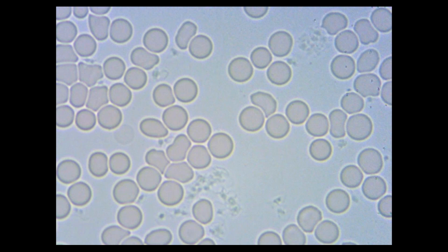And then also most of your white blood cell anomalies are only visible in dark field. Now, these would include assessing the lobes within the neutrophils and other white blood cells, assessing white blood cell viability, and also the white blood cell count. Also, we're able to see target cells more clearly in dark field. It's easier to distinguish between various types of crystals in dark field, and there are also certain microbes like L-form bacteria that can't really be seen in bright field.